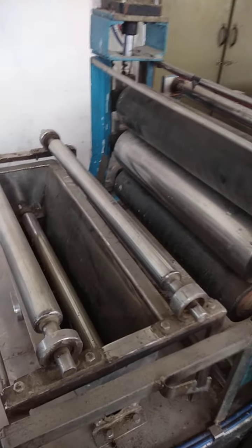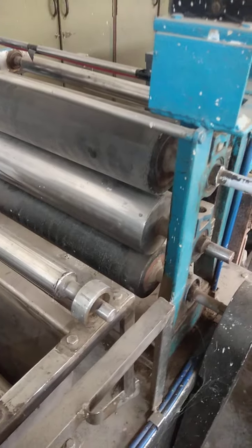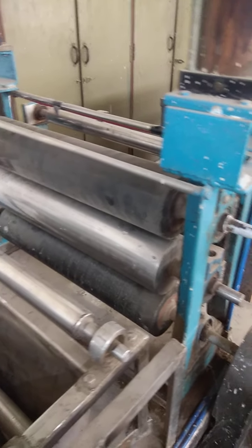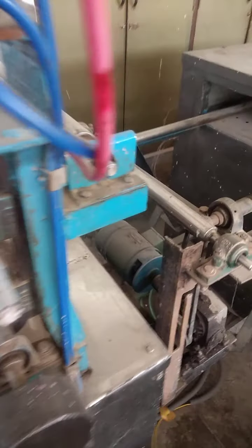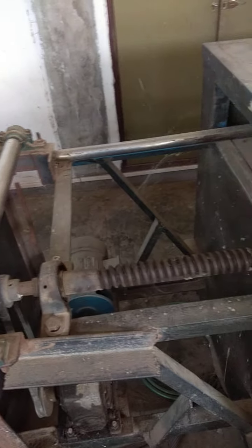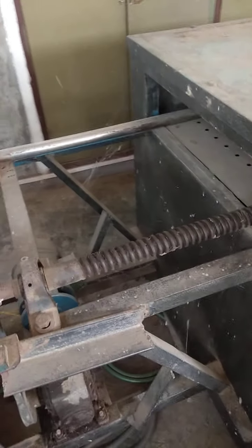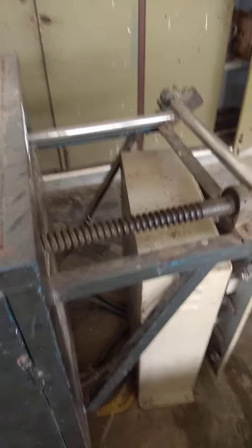In this machine we take the solution in the trough and pass the fabric through it. There is a three-bowl padding mangle with a stainless steel roller at the center. The fabric passes in synchronization through guide rollers — stainless steel guide rollers — and then through the drying chamber, from which we get the dried or cured sample. This is particularly useful for pigment printed samples.